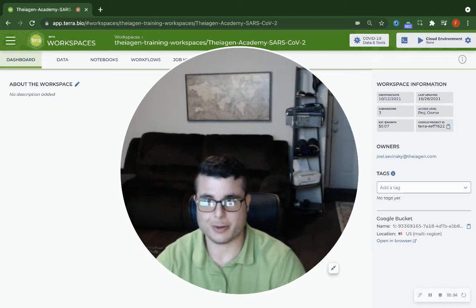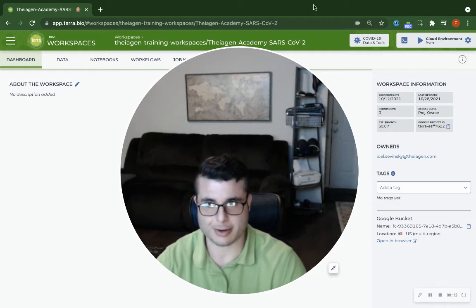I'm Frank Ambrosio, a bioinformatics scientist with Theiagen Genomics, and in this video, we'll be going over the process of running the Titan ONT workflow for genomic characterization on Terra.bio.